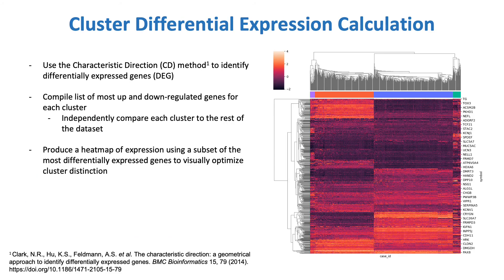I next find the most differentially expressed genes, or DEGs, for each cluster by calculating the characteristic direction for each gene and comparing it to the rest of the dataset to get the up- and down-regulated gene sets for each cluster. I then generate a hierarchically clustered heatmap of the DEG expression profiles, where the color coding along the top indicates cluster membership of each patient. Here we can see the existence of four clusters very clearly reflected in the heatmap.